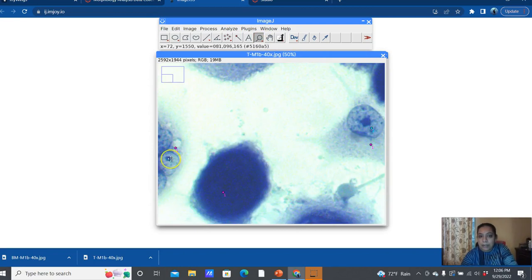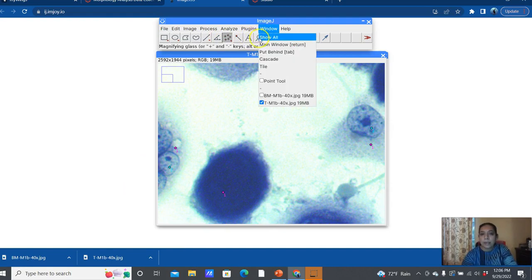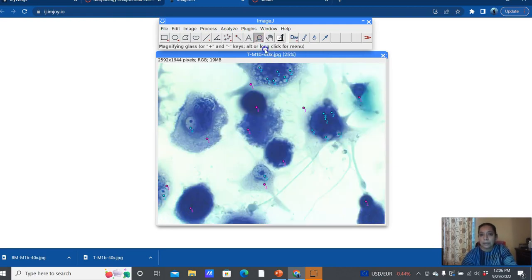Now, some of these cells are not going to have the full nuclei. The cell body is not fully there, but you do see some of the nuclei fully there. So that means that I can still utilize those nuclei in my counts, right? And so I will continue to look through and find any other nuclei that might be present there.